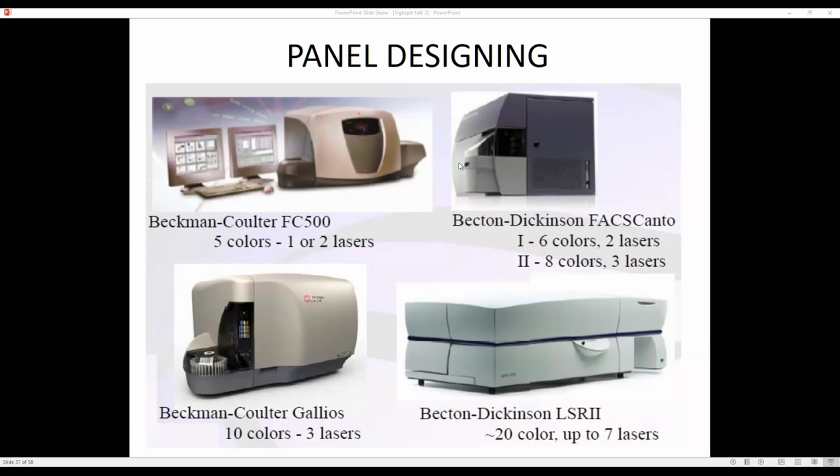There's another comment on the chat, asking what percentage is acceptable. It's more than a percentage; I would say it's time. Say, for example, you work in a lab with a high load. For me, I cannot spend a lot of time on compensation.